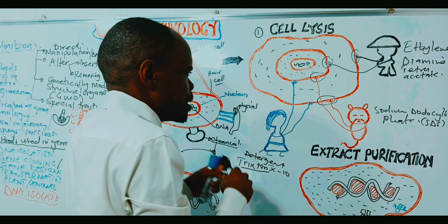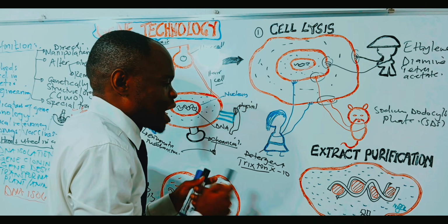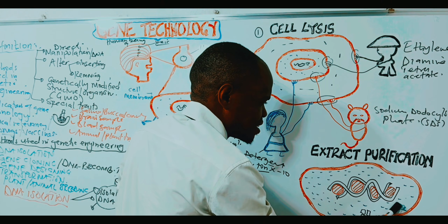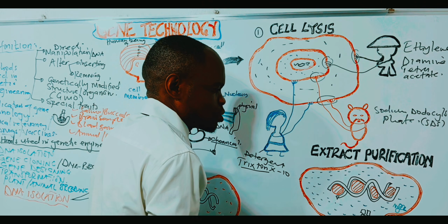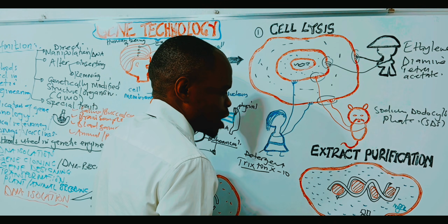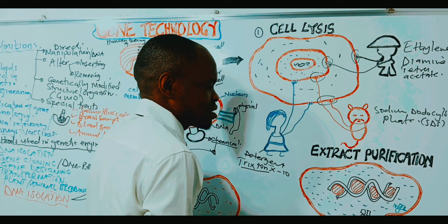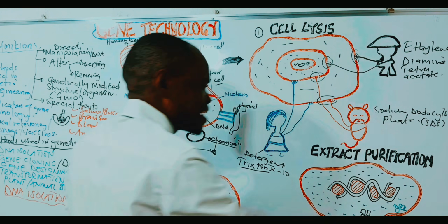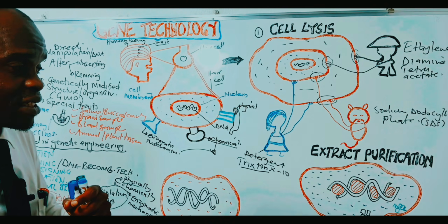The proteins are there. We have this one here. We have the sodium ions. The sodium, those are the ions. We have the proteins here, the histone proteins. We also have the DNA. So we have very many components which are just scattered there, which are called impurities.